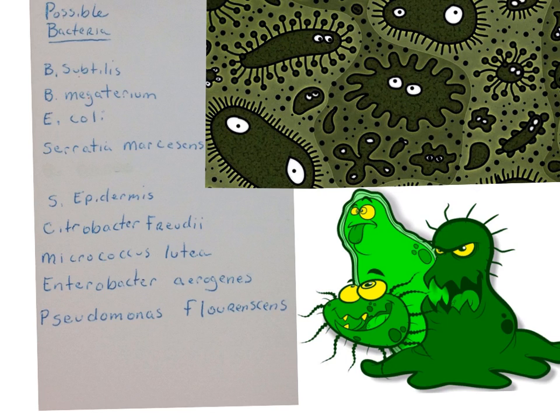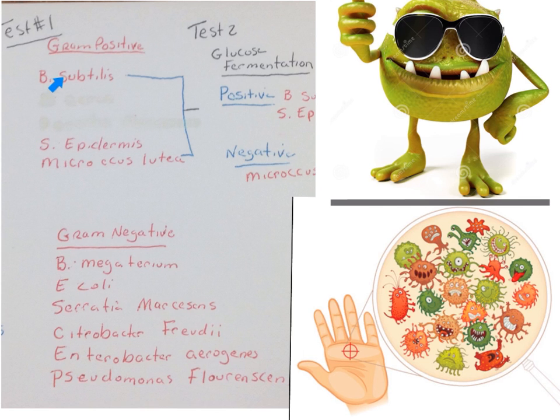So what I would do is say, okay, let's divide these up into gram negative and gram positive bacteria. And here I have that 3 of these are gram positive, and the remaining ones are gram negative. So my unknown bacteria, I run the test. If it's gram positive, I have now discounted all of these bacteria, and I'm now just looking at 3. Now let's say that our unknown was a gram positive bacteria. Okay, so it's one of these 3. Now I'm going to go back and look at the possible tests that I could run, and I'm going to see what could I do that would break this down.